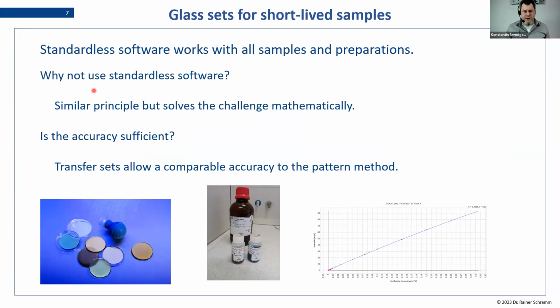Standardless or semi-quantitative methods, there are various different ones out there depending on your spectrometer, but usually each spectrometer comes with one of these packages. And the idea is that standardless software works with all samples and all preparations.